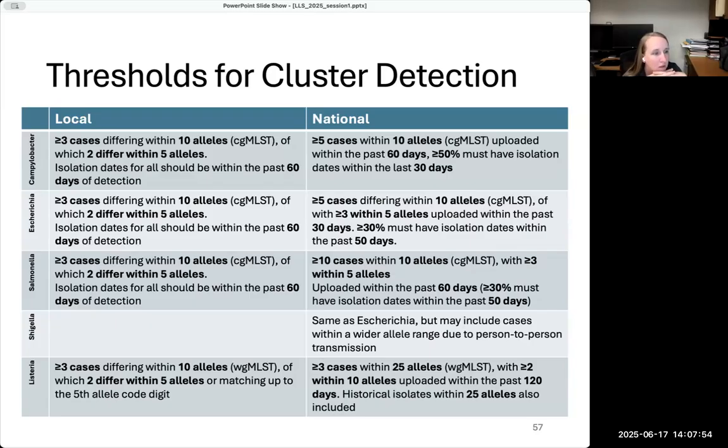Someone said, should we interpret digits beyond an Xcode as having the expected threshold? As far as I know, yes, past that digit, it should be within the expected threshold. It's going to be at least less than 4 times, right? Because if it was more than 4 times at a digit past an X, it would also have an X in that digit. So it could be what is expected, or it could be higher than expected, but still less than 4 times past there.